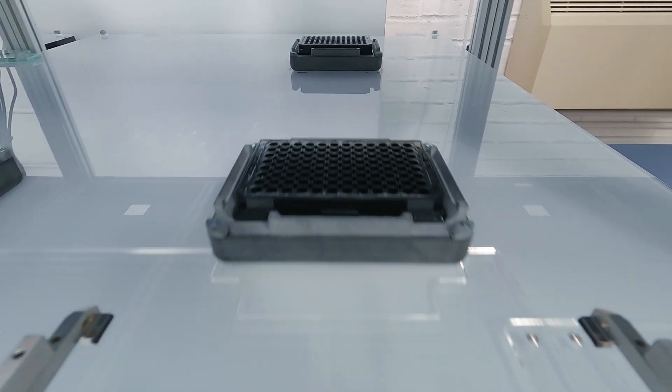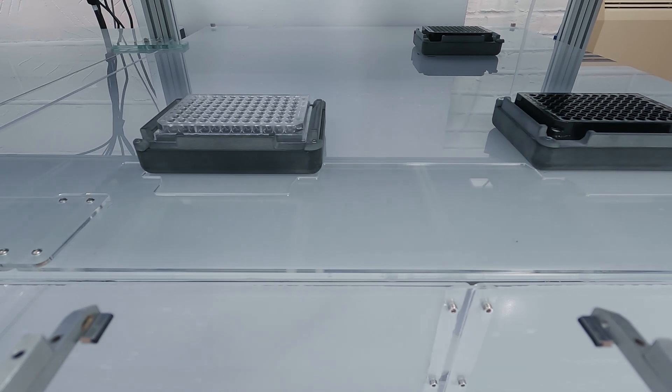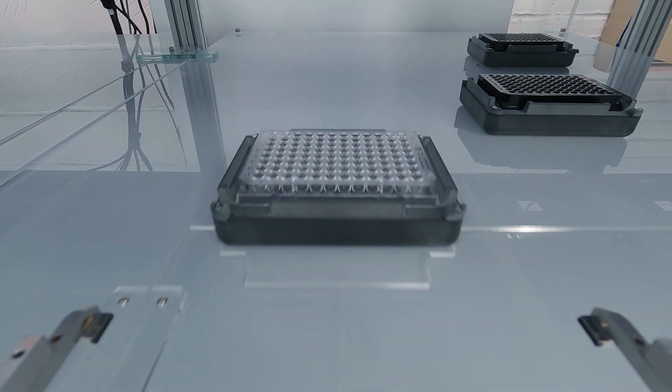And if later on you want to change your system, instead of getting a completely different automation system, you can take instruments out and place new ones in.